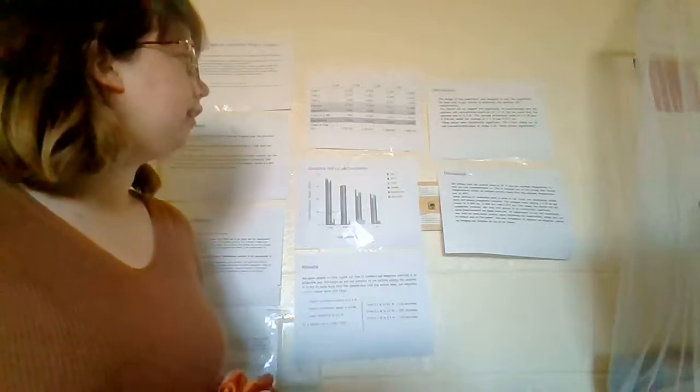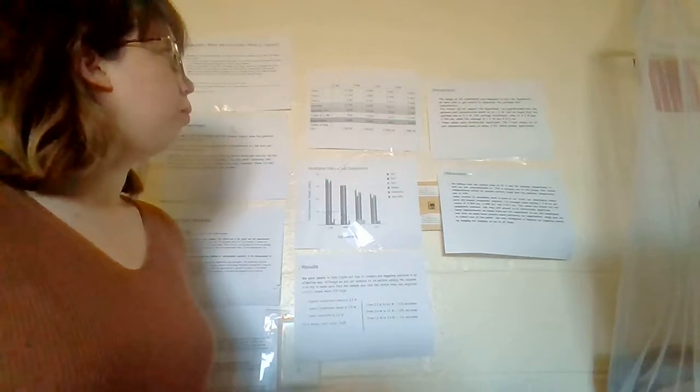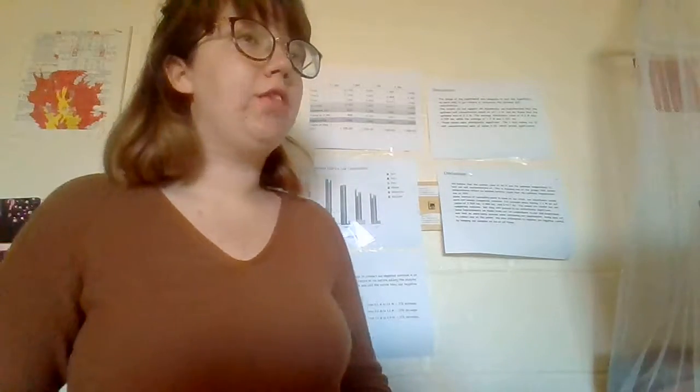We also tested our standard deviations, which are all very low. With 0.3 molar, it's 0.04, then it goes to 0.008, 0.06, and 0.044.